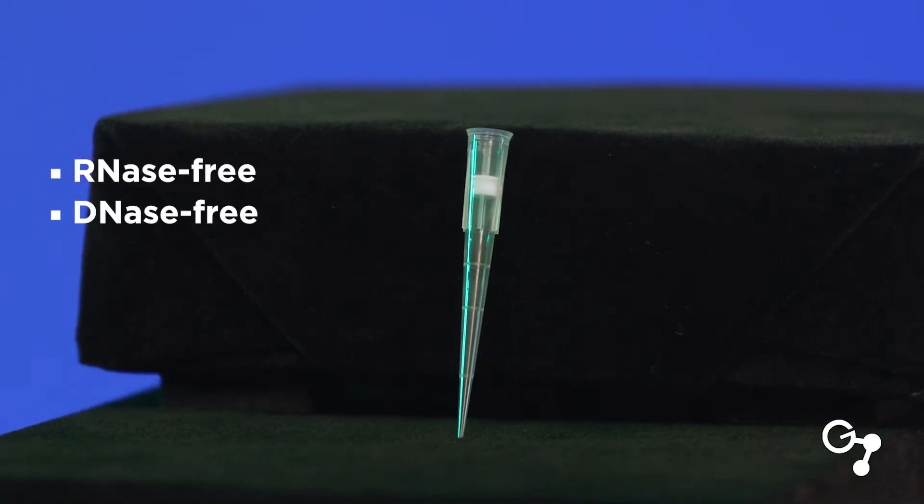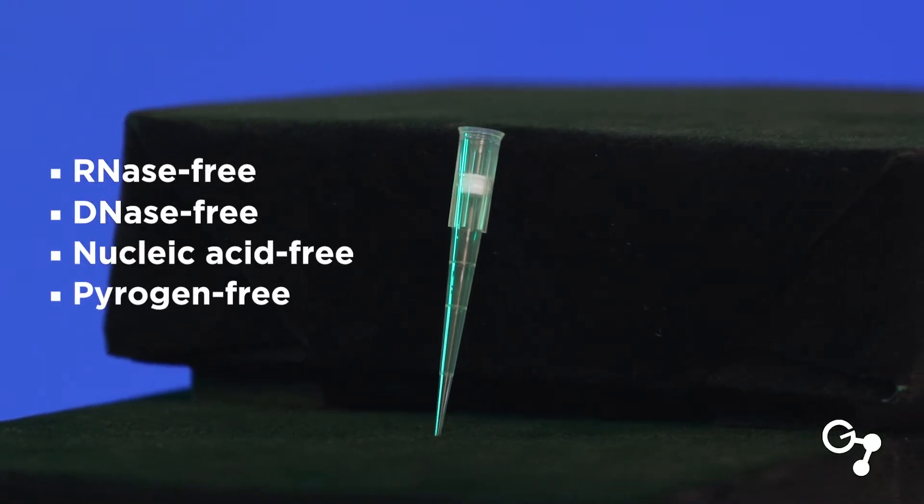They're certified RNase, DNase, nucleic acid, and pyrogen-free materials.